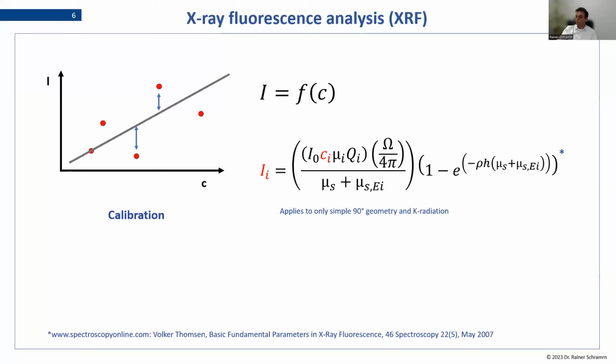So next question, how do you define the best thin film? Does it depend on the sample or the XRF device? So thin film always has to be taken into account about thickness and material. The thinner the film is, the more transparent it is for X-rays. And then we distinguish between polyester films like Mylar and polypropylene film. And polyester is absorbing more, so it's considered more thick.